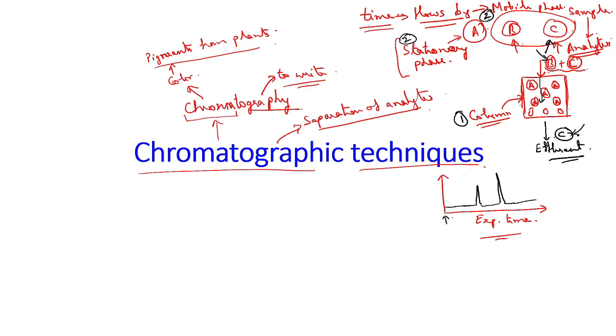Then we have a mobile phase. The mobile phase will be dissolving the sample, and the sample will be containing the analytes. So the analytes, the fourth part, they will be dissolved in the mobile phase.